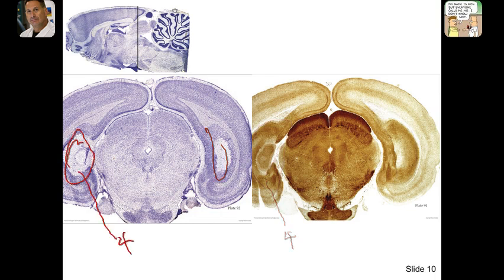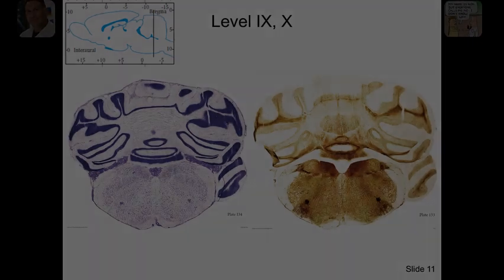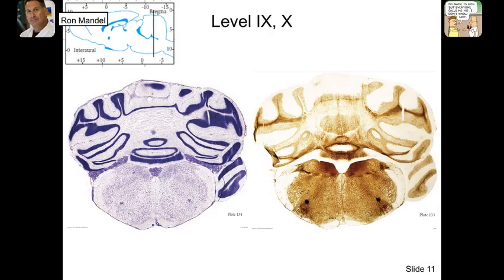And this white matter here is the cerebral peduncle. We're in the medulla now.